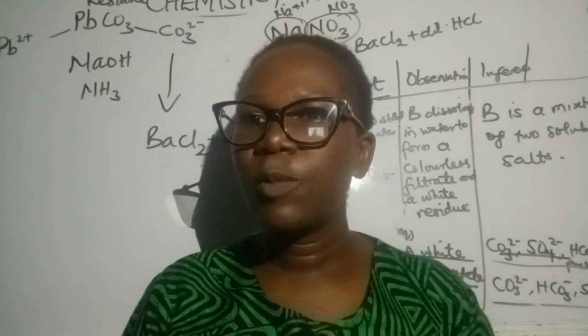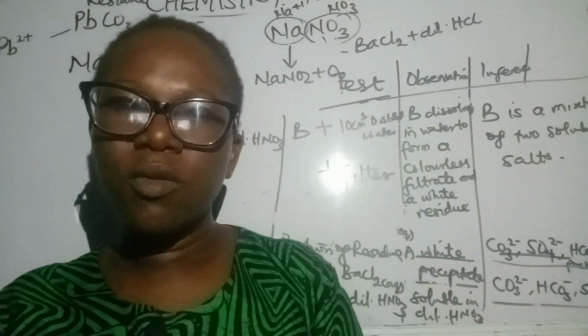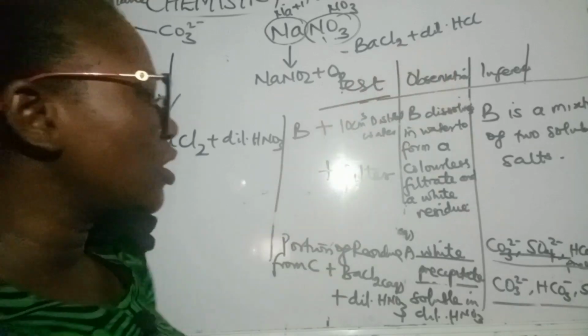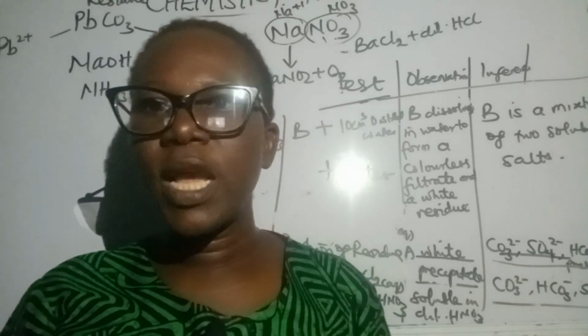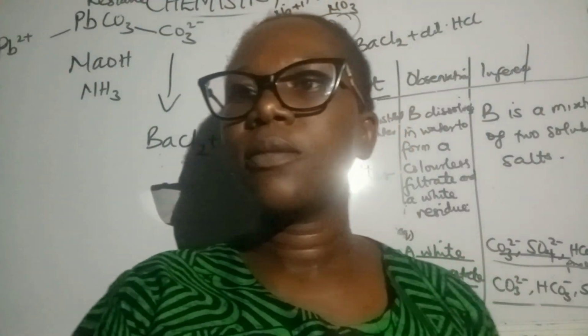And if you cannot spell precipitate, please do well to learn the spelling of precipitate. And don't forget, if you are recording the test by yourself: test, observation, inference. At the front of sodium hydroxide and any other reagents used, put your aqueous, whether it is ammonia or sodium hydroxide. I wish you all the best in your exam.